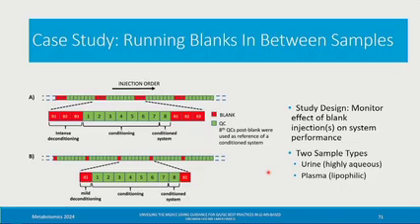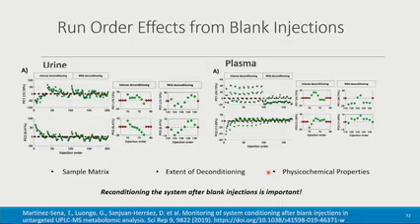And if we look at the data from here, and honestly, as a GC guy, I found this initially kind of surprising until I stopped to think about it a little bit. What we can see here in A, where we ran a lot of blanks, is where the samples project in principal component space on PC1. Under normal conditions, your QC should project somewhere up here.